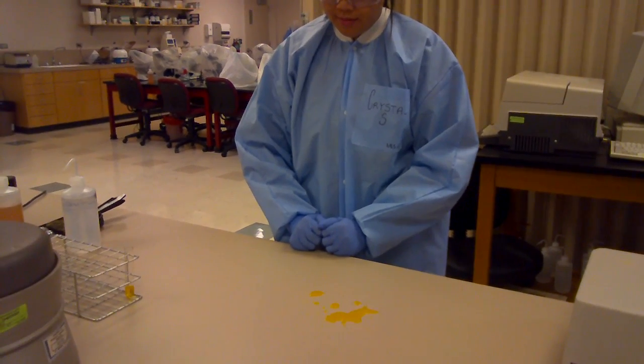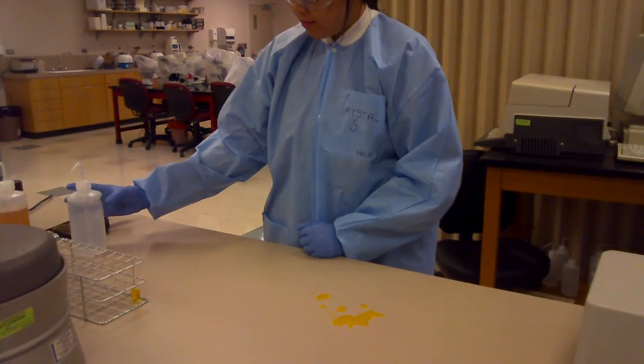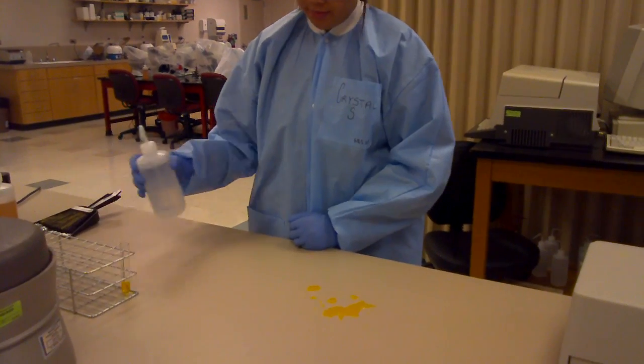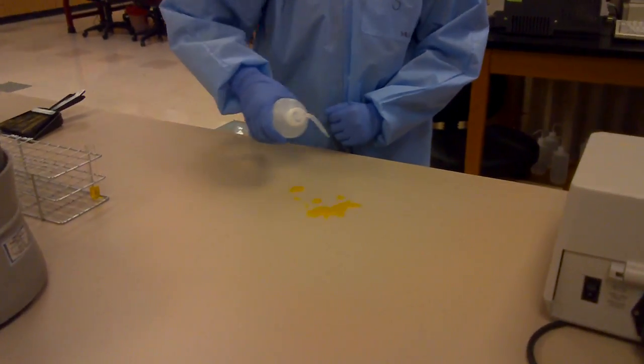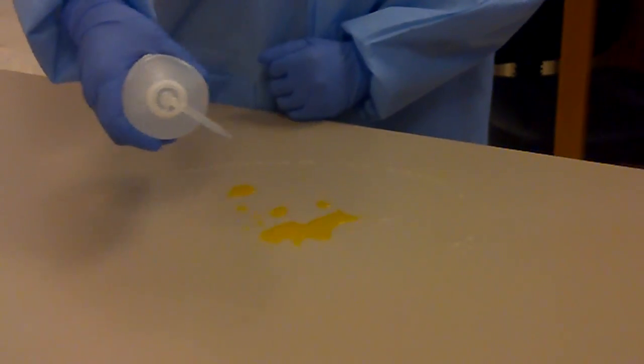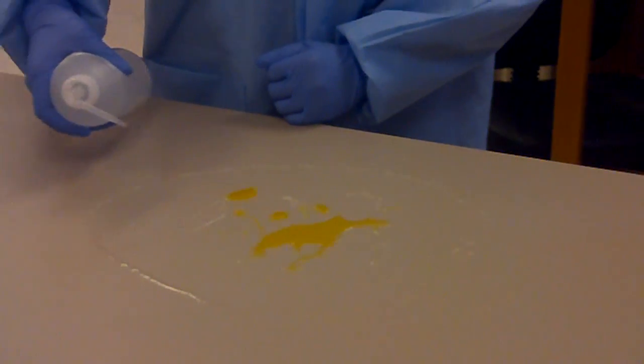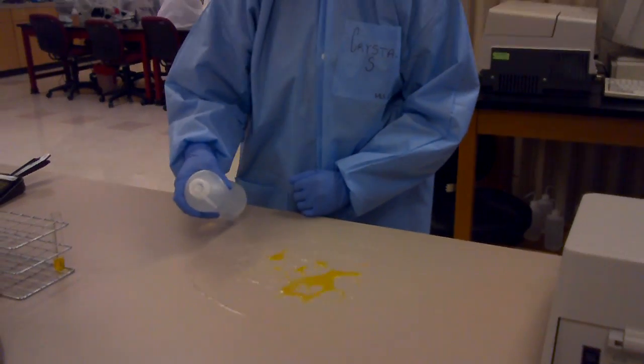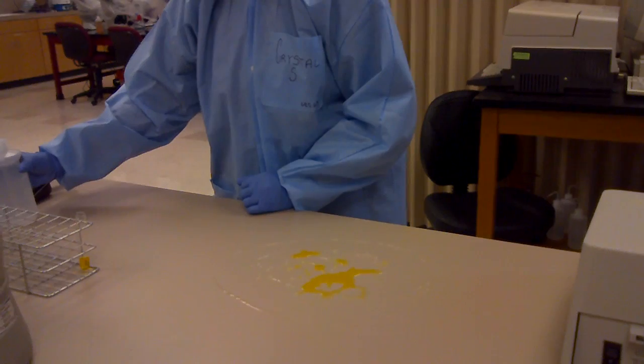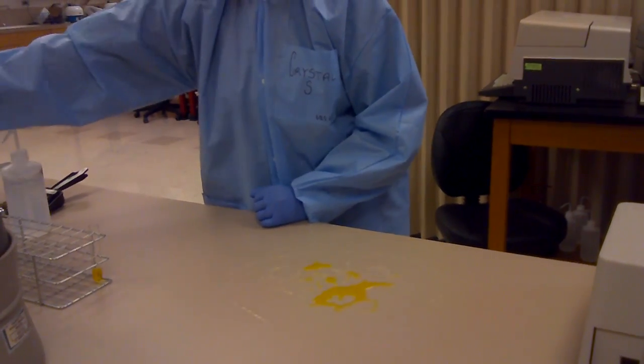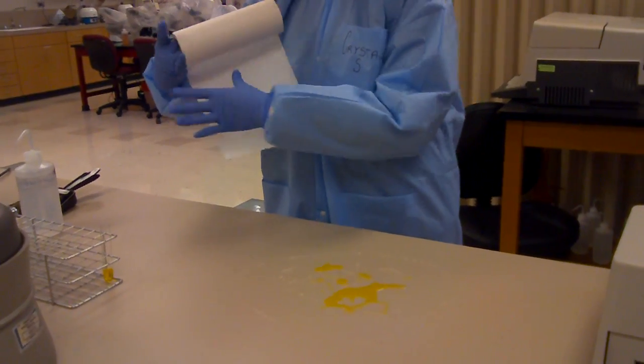Use 1 to 10 diluted sodium hypochlorite solution to cover the spill. Then cover the spill with paper towels until the spill is completely absorbed.